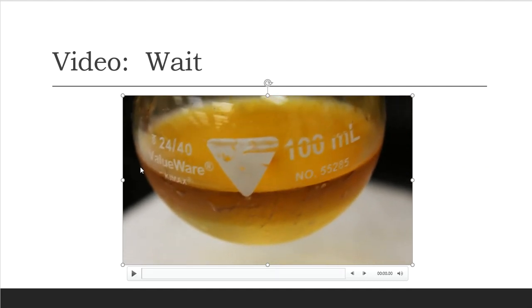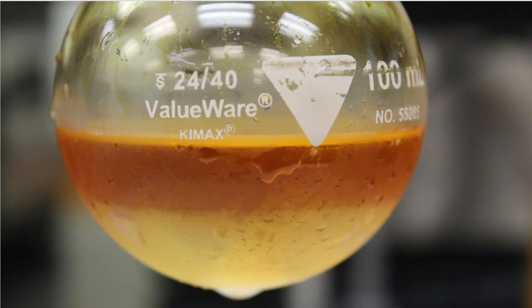Okay, did somebody say that they needed a picture or an image of maybe what's happening? Well, sure you did. So I've got one, wouldn't you know? Let me pull it up so I can show you. So this is what it looks like, folks. After this addition of the water, I see this in my boiling flask. Can anyone tell me why there's two layers?